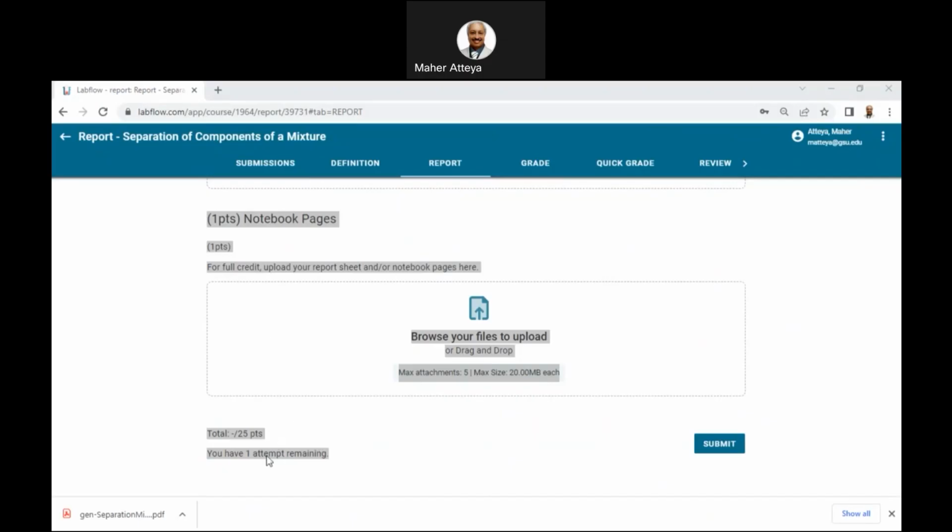Let's clean up. So 0.101 divided by 0.812 multiplied by 100 is 12.4, three significant figures. 12.4 percent.